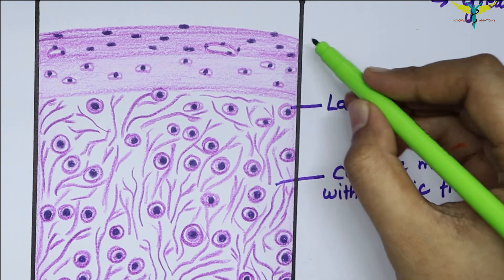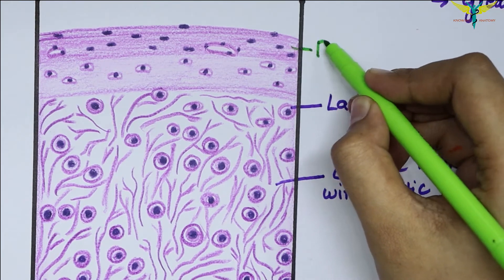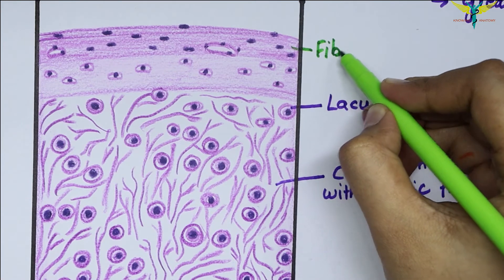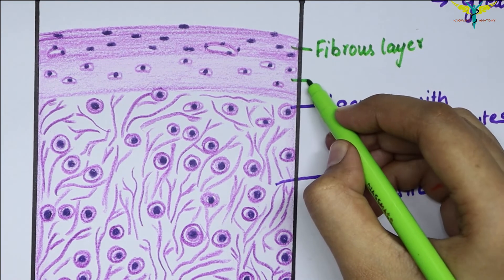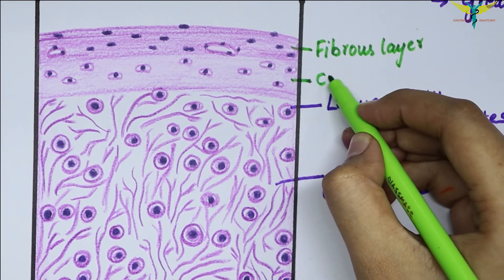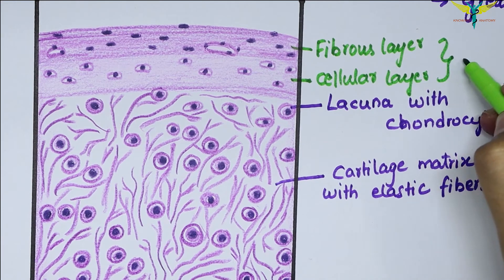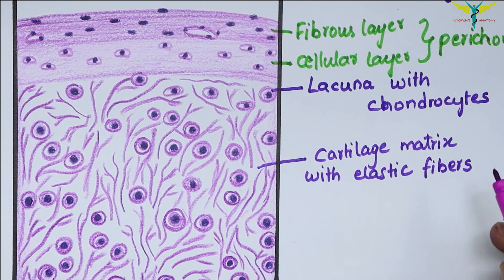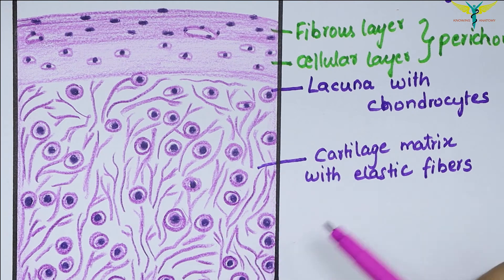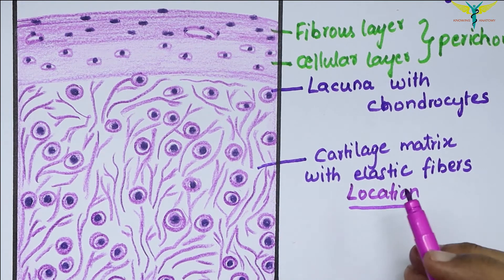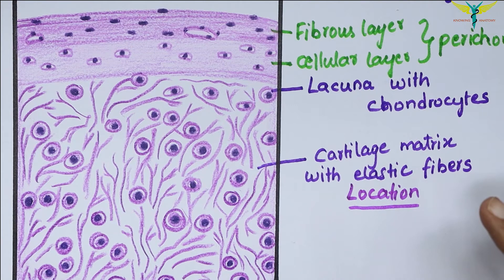The perichondrium is present in the elastic cartilage and shows an outer fibrous layer and an inner cellular layer. This whole structure is the perichondrium — this is the outer fibrous layer and this is the inner cellular layer — and both together constitute the perichondrium.